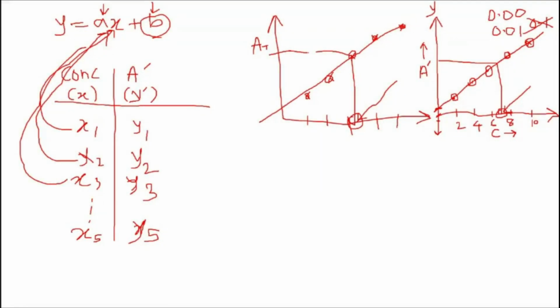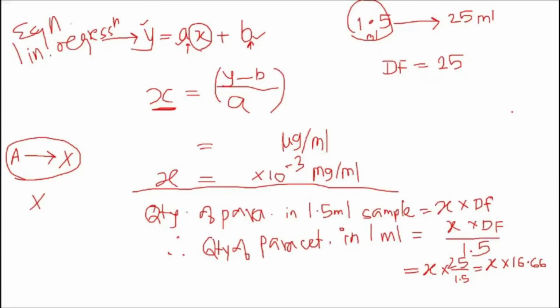Yes, Prerna remembered it. 1.5, but she only told 1.5. What about 1.5? Yes, divide that value with 1.5 to find the concentration of paracetamol. To find the quantity, why I'm telling concentration? No, find the quantity of paracetamol per ml. If you have understood till here, go on to find concentrations by graphical method and by linear regression line. Hurry up, take the screenshot.